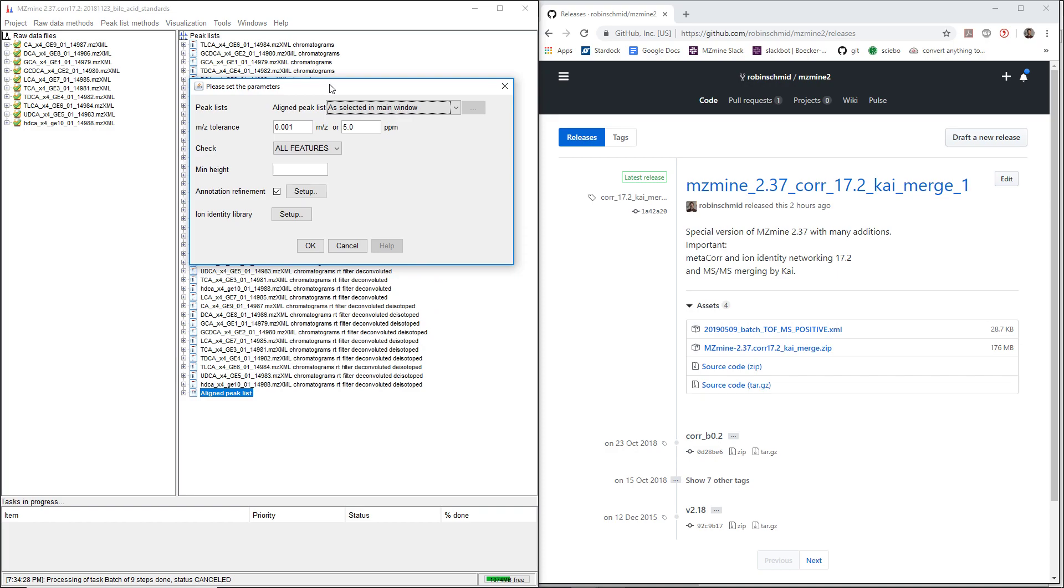In this module, this is always going to run on row groups, so you need to perform the row grouping before.